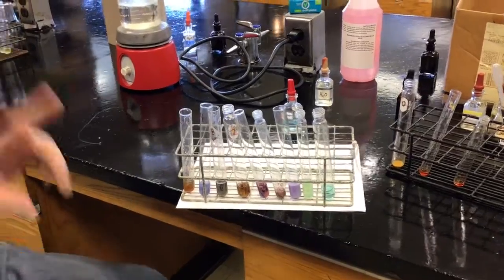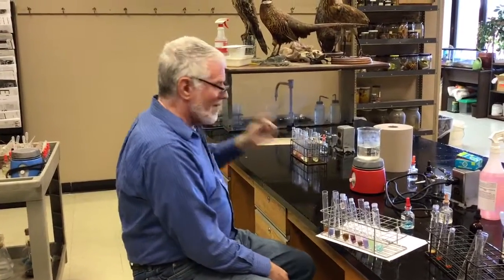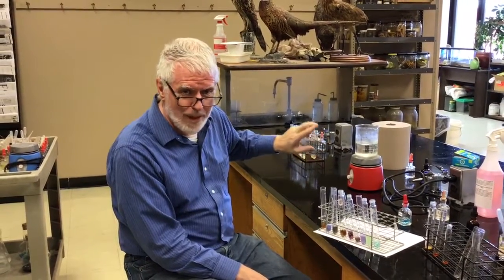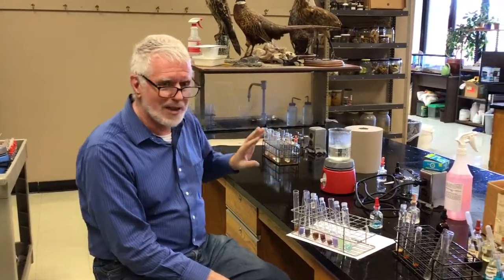So we have 2 more columns to do. We have the grease spot test. That's still sitting over there drying. And we have the Benedict's test, which is going to involve putting a whole bunch of Benedict's on food and putting it into the boiling water. So that's going to take a little bit of time. So we're going to do that on the second video. So we're going to stop here.